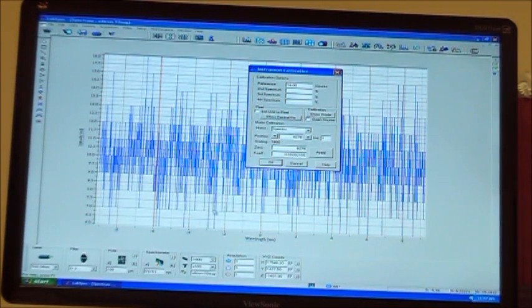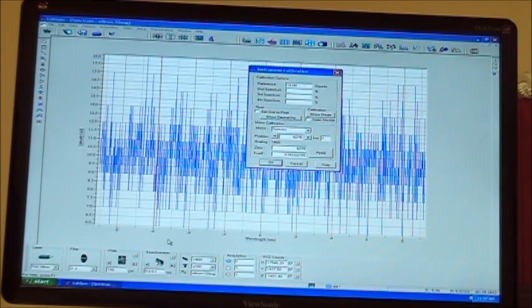Once it falls on 0, you would come down to spectrometer, click on the left arrow to re-zero the drive again, and acquire, make sure it's still at 0. Whenever going to 0 order, always click on the left arrow. Do not type in 0. When you click on the left arrow, the instrument goes to the 0 order stop switch.